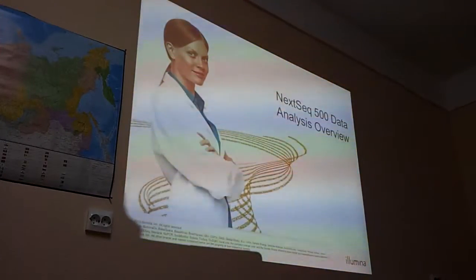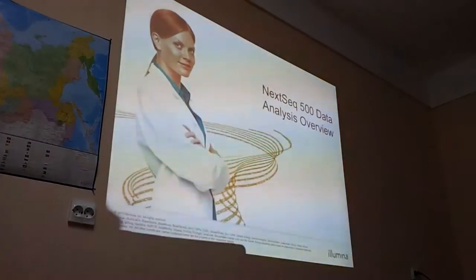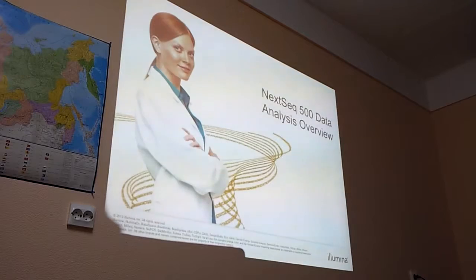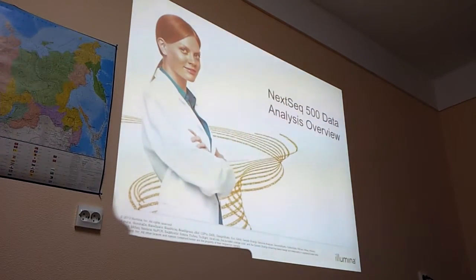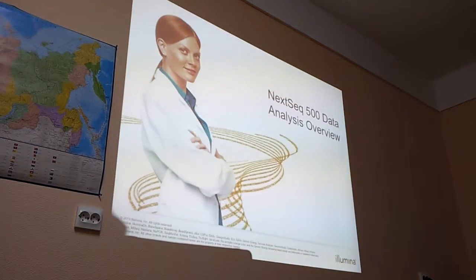Functions, and then a little bit more about BaseSpace. Okay, and then also I have a short presentation about what to look at, how to look at the data quality. Good.